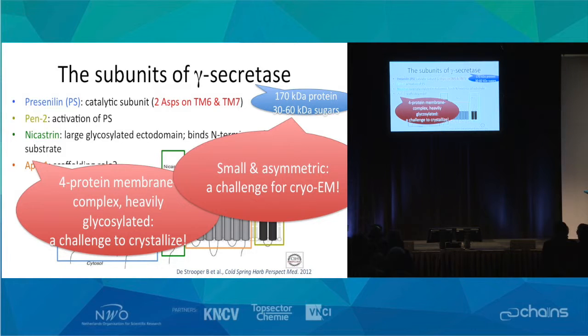Yet, also from the cryo-EM point of view, it is not an easy project. And some people, when we started this, thought this was actually too difficult because it's only 170 kilodaltons worth of protein. And we didn't really know how it looked. And it was a general challenge for cryo-EM as well.